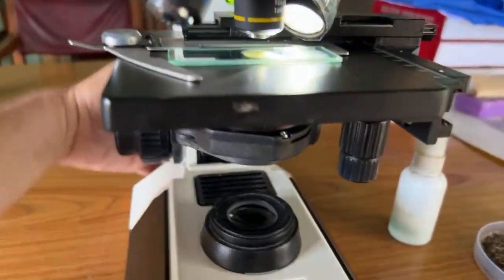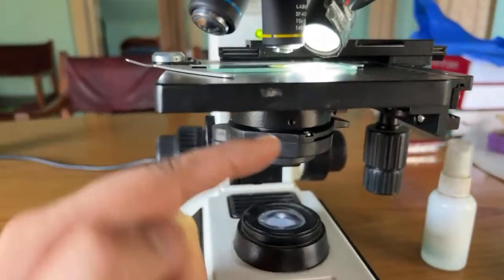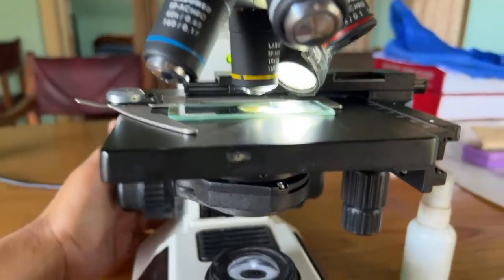see, what happens with the generally used process of a microscope is that there is a light source which makes the light travel through the sample here, and then you see it. And this is an X-ray sort of a view. What I have tried here is a basic setup. I'd like to show it to you.